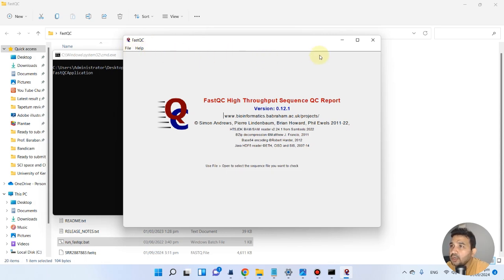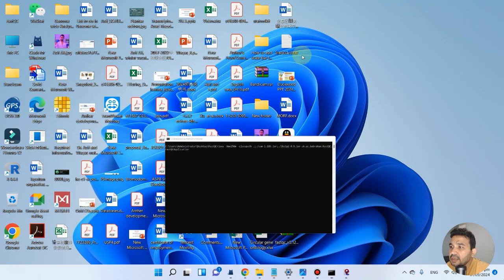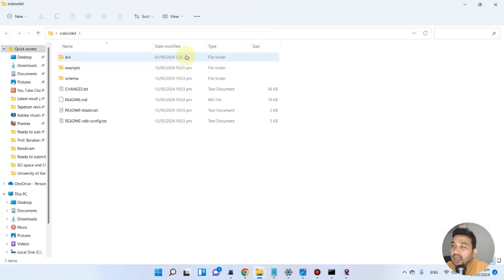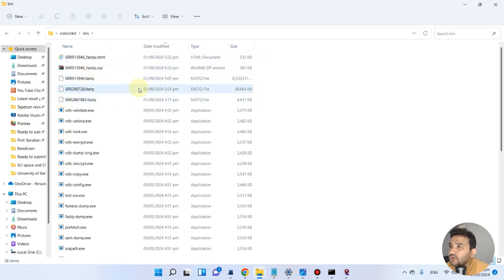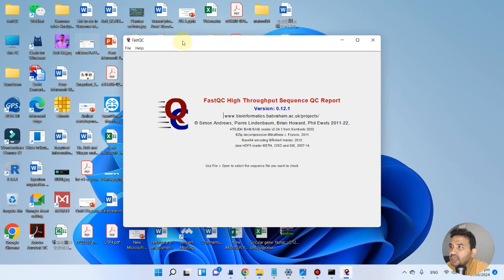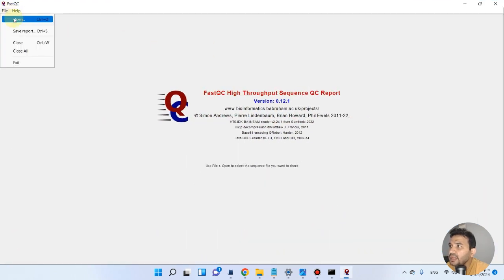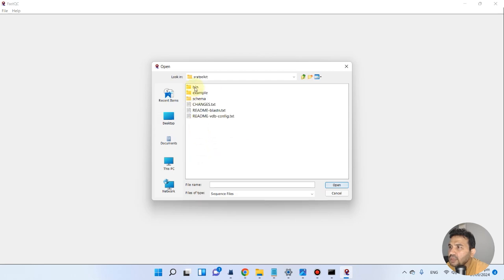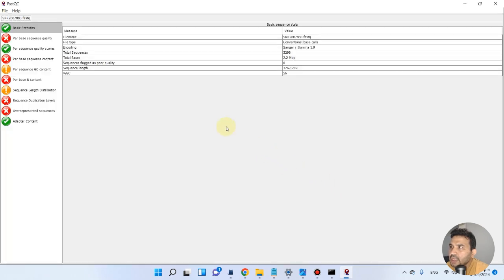In the previous videos we downloaded SRA data using SRA toolkit. Let me show you that data — here is our SRA toolkit folder. The data was downloaded as FASTQ files. You can see I have three FASTQ files here. We will use these three files to run with FastQC. Go back to the FastQC software, click File > Open, navigate to desktop, then SRA toolkit, then bin, and you will see the three FASTQ files. Let me open the first one.